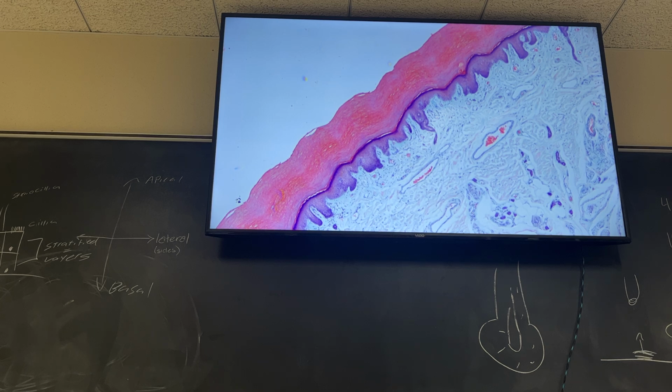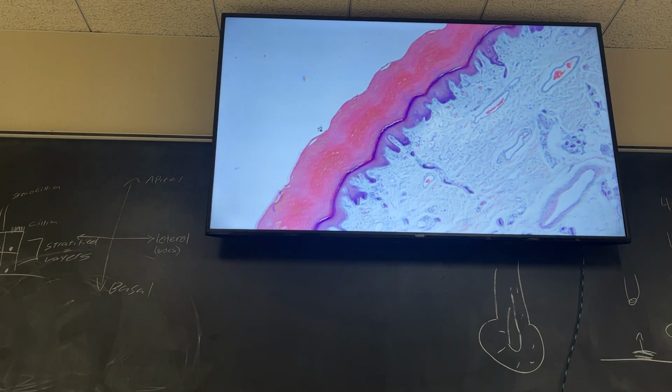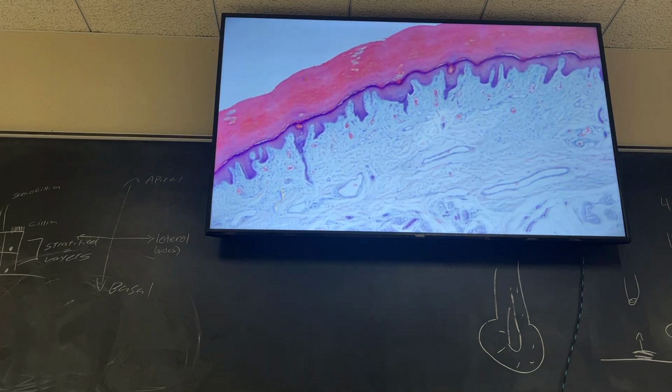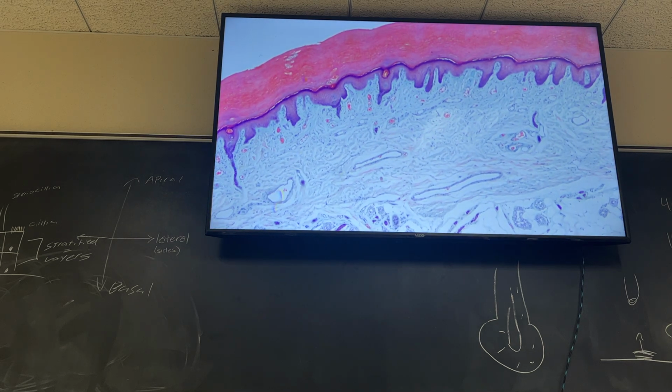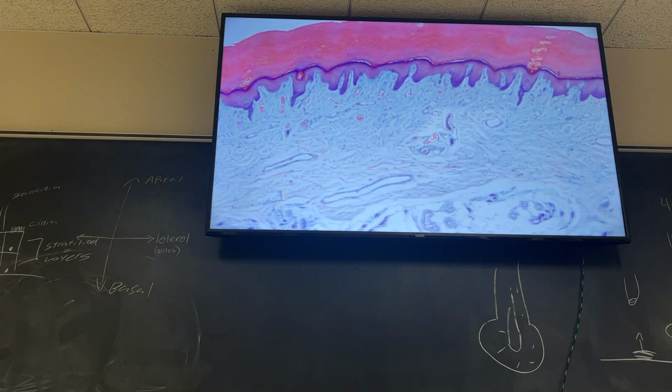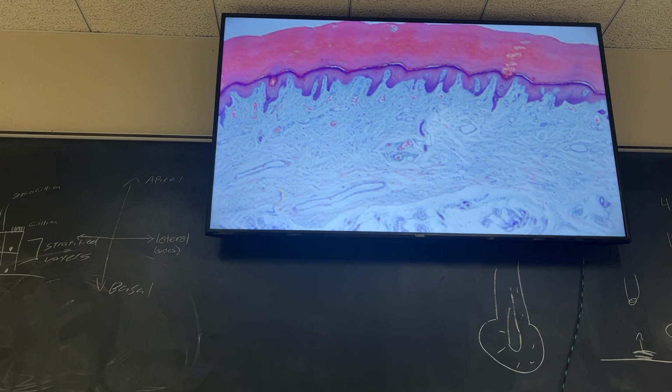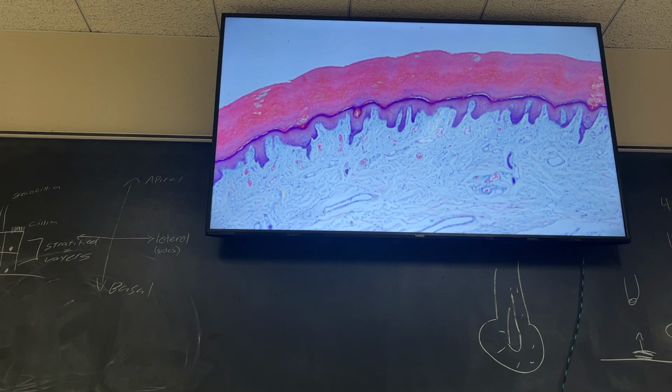Meissner's corpuscles occur up near this skin area up here. That's a really nice one there. Let's look at that one. So everybody can see it, I assume, right?